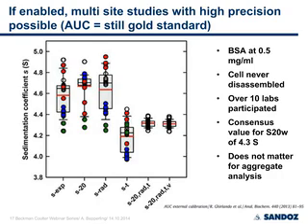And also to report, of course, S values and state whether you have corrected them or not. Okay.